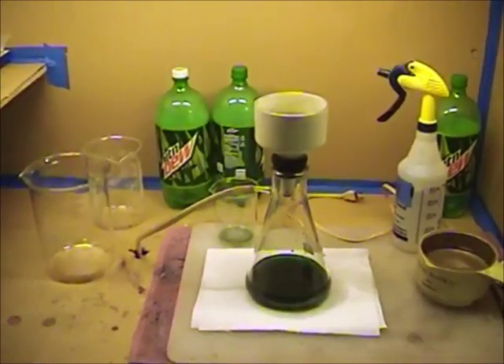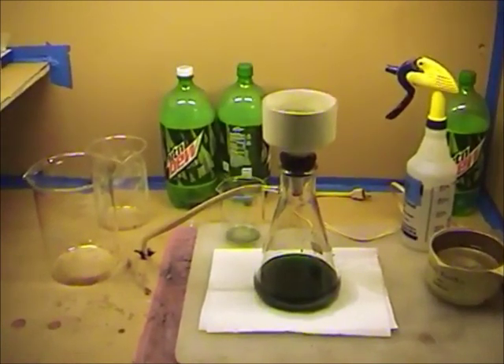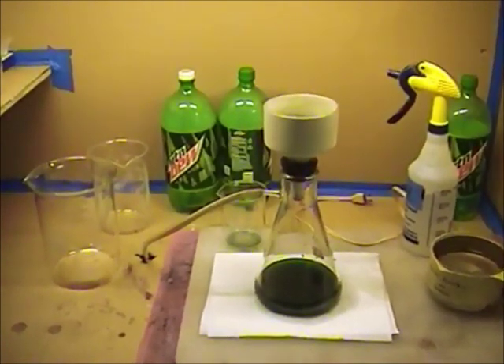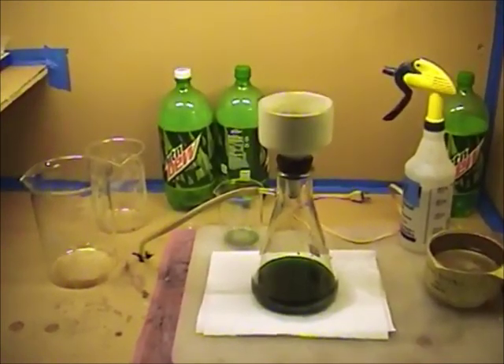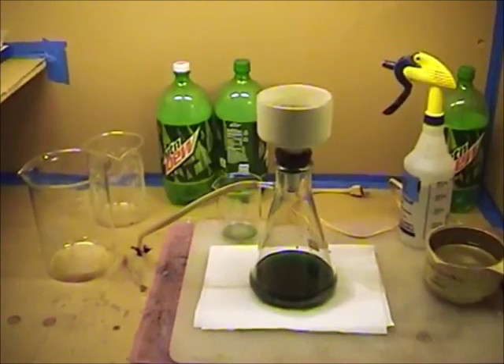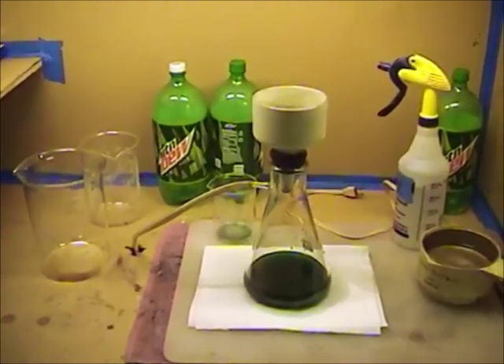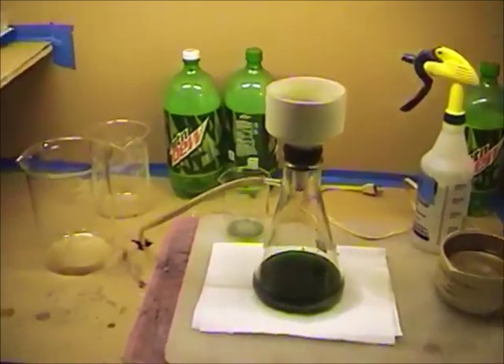Good morning gentlemen, we're back. I wanted to show you where I was at. Last night after our precipitation started I went ahead and filtered our solutions. But overnight there were still some chemical reactions occurring and I had some more crystals precipitate out. So I'm in the second stage of my filtering.